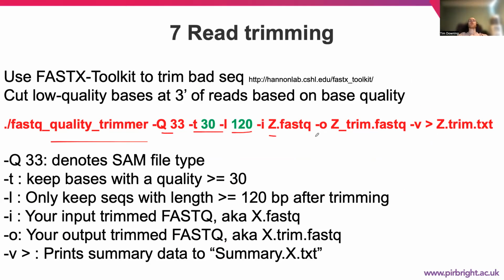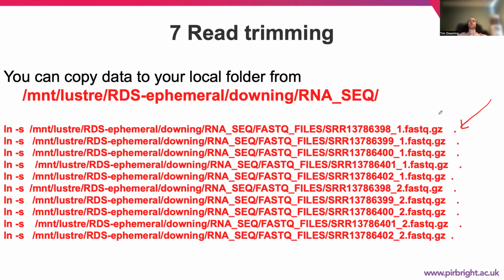This is our input file name, which you will have to change, and then our output file name. You'll need to do this for the forward reads and reverse reads, _1 and _2, as you saw before. We have _1 and then _2.